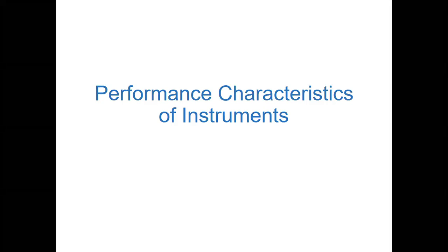analysis of some samples. And the first thing, before we move to a particular analytical method, we have to collect a sample. We learned about how to do the sampling, so now we know how to collect samples. Then after we collect the samples, we should determine which instrument we need to use, because there are lots of analytical instruments in the labs. So we have to have an idea about the instrument that we are going to use for the analysis, right?